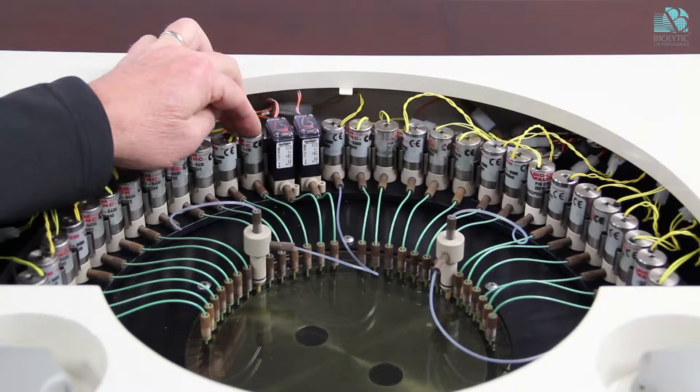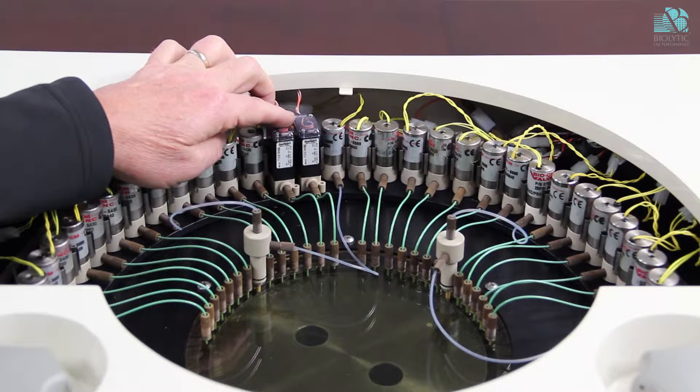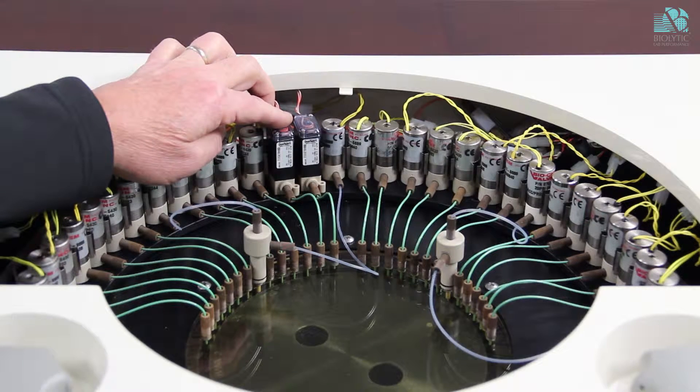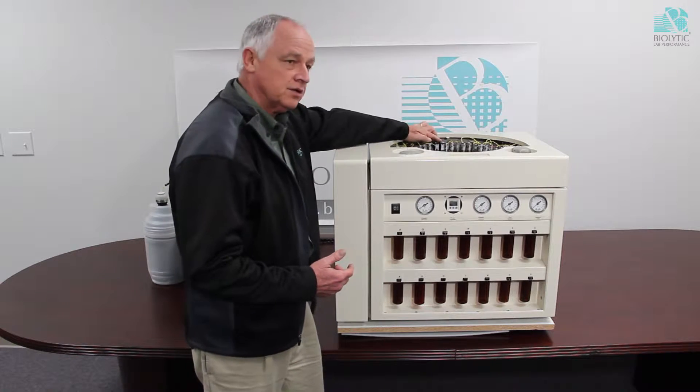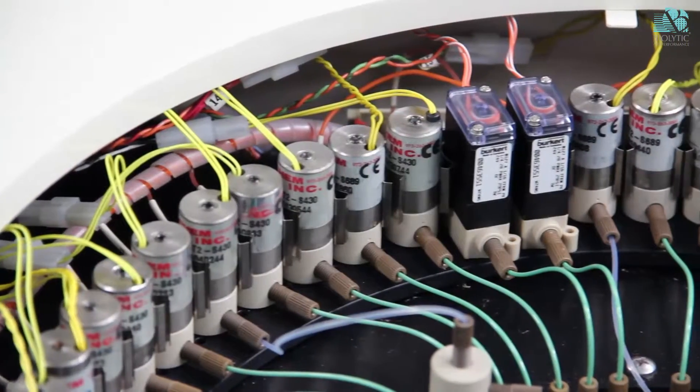The round valves, these are the original design. These are a different valve made by a different company. We find these to be much more robust and also they are lower cost. So it's what we consider to be a better valve.